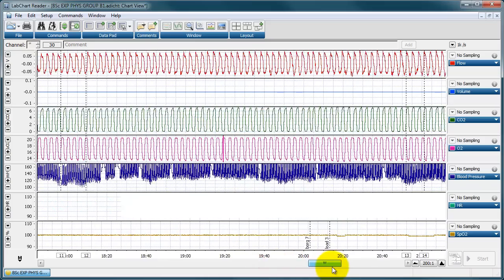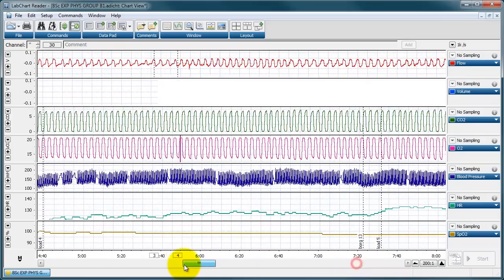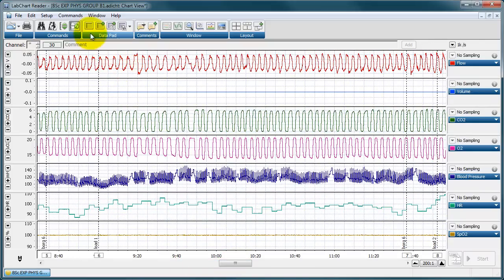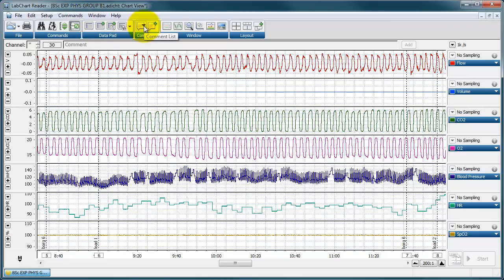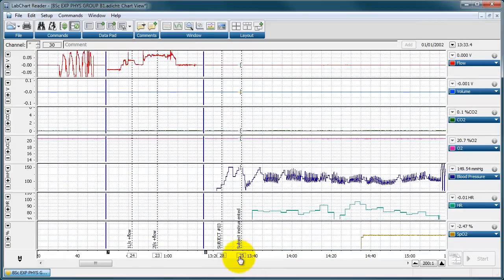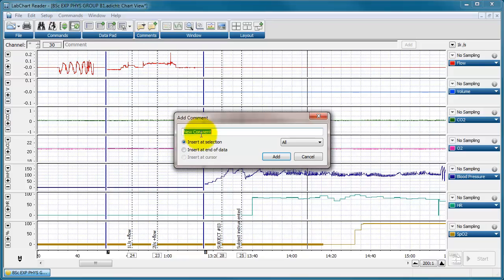There's also a button to auto-scale all channels at once, and another button that continuously auto-scales as you scroll — when enabled it turns green and rescales all channels automatically as you scan through your data. This was introduced in version 6 of LabChart and is very useful. Additional buttons include viewing the data pad, adding data to the data pad, and viewing your comment list, which lets you click any comment to centre it on screen.